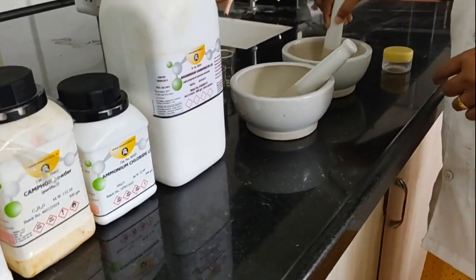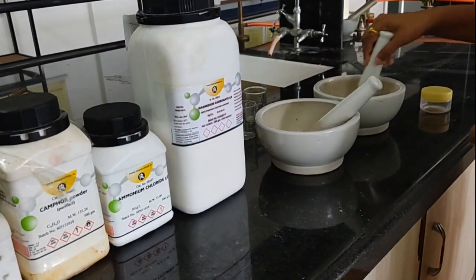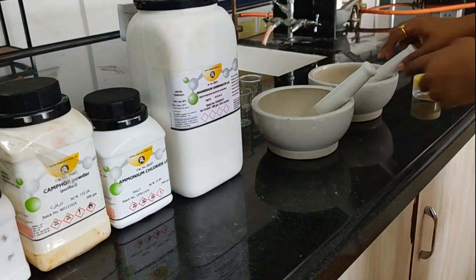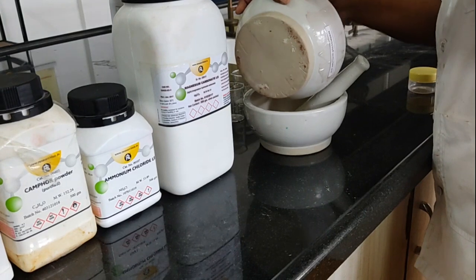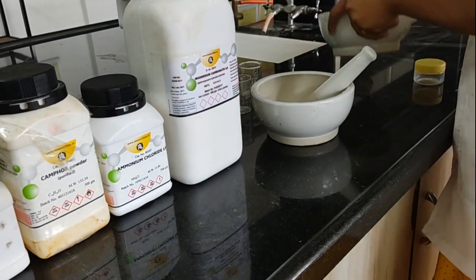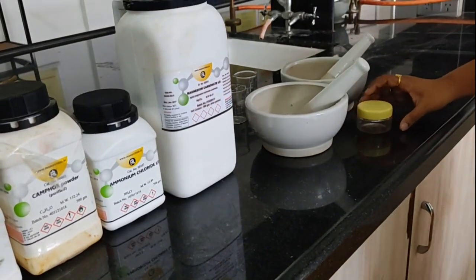After proper trituration of the powders in both the mortars, I am going to transfer the powder from the first mortar into the other one. After transferring all the powder, now I am going to transfer it into this container, and then we will proceed to the next labeling part.